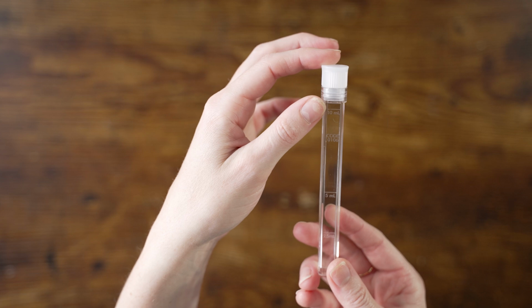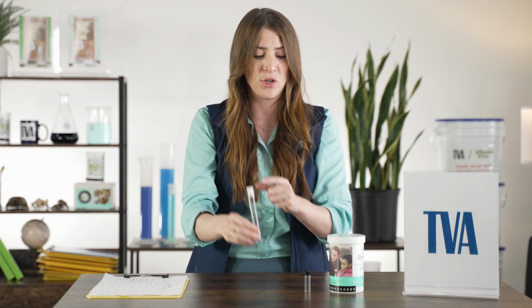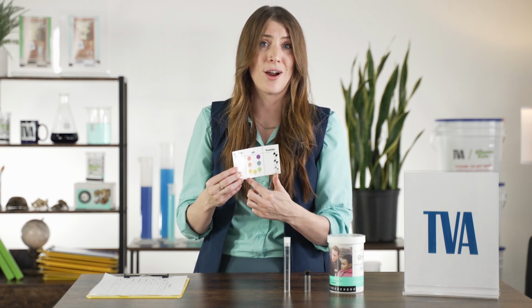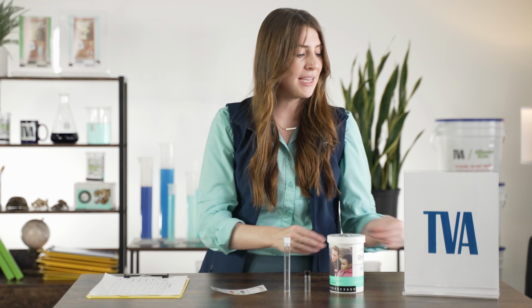You should also have a plastic test tube. This plastic test tube is for our pH test. On the outside of our test tube, there are numbers and letters. We'll be using the 10 milliliter mark to do our pH test, so make sure you see the 10 milliliter mark on your test tube. You also should have a comparison card. You can't finish filling out your data sheet if you don't have a comparison card, so it's important to have one with you. And finally, you should have 2 foil packets.